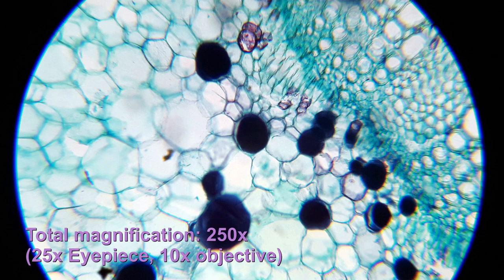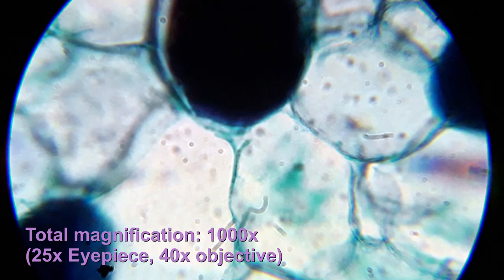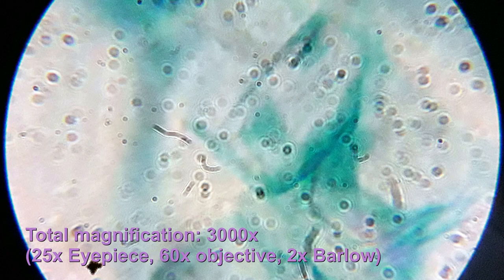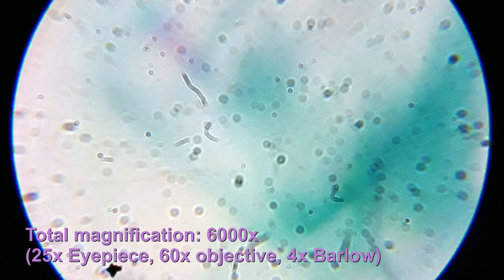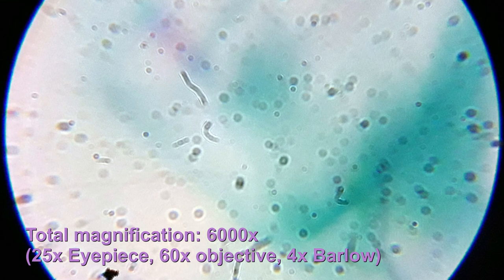This is a plant tissue cross section of a plant stem. We're going through the same thing again, increasing the magnification. So far still everything nicely visible. But then again, just like before, we are at a limit. It becomes more and more blurry the higher we go with the magnification, and we are losing a lot of contrast. Almost already at the resolution limit. That is the resolution limit and we see again that there is a lot of dirt and dust on the system. That's one of the things that speaks against very high magnifications. If you add more optical elements, there's more possibility for catching dust.